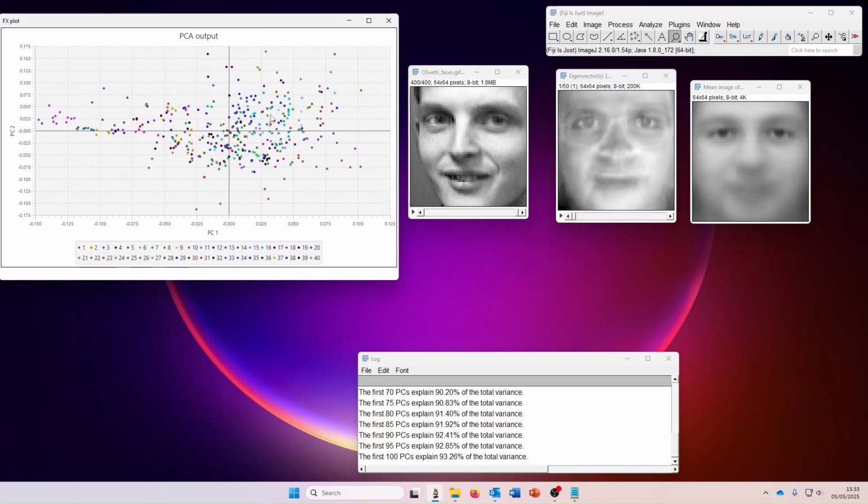The interactive scatter plot, as before, is generated. These are colored by ground truth state. We can see that some faces cluster nicely together. So number 22 here, I would just toggle on and off using the interactive plot. And PCA is not the best at clustering these, but clusters do broadly fall within certain zones. Now, we can also click on any of these to highlight the underlying image in the data set. So we can see it's automatically updating here.